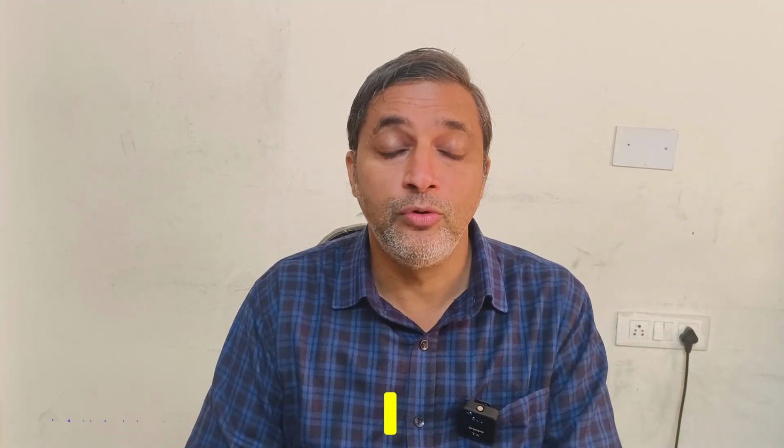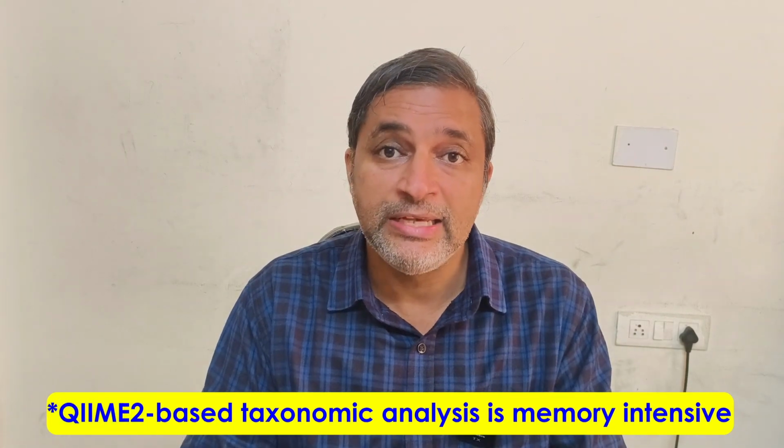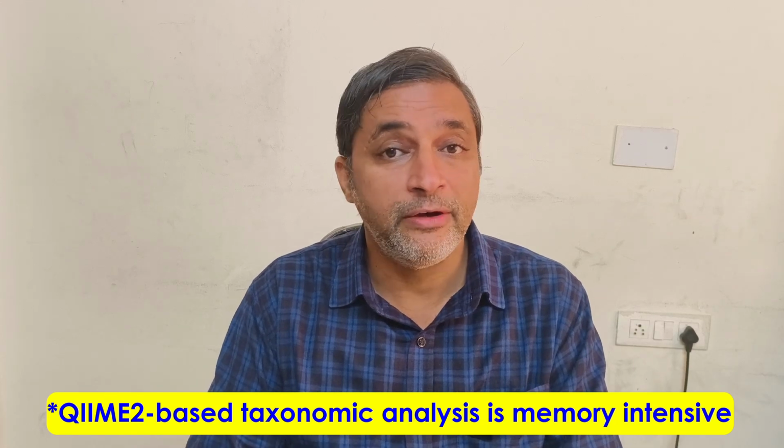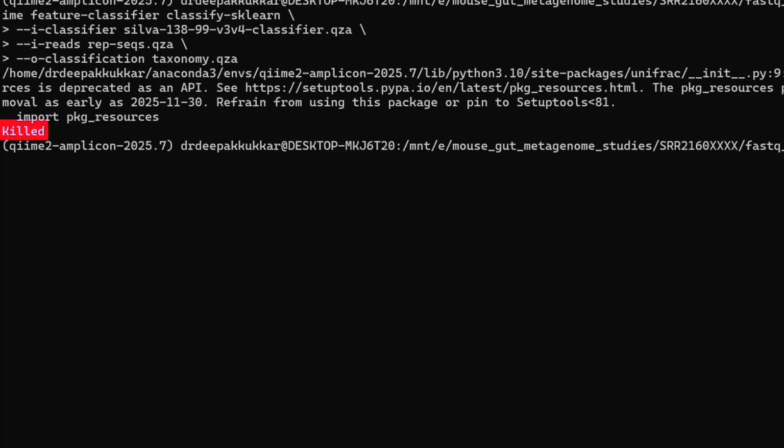And now, as you can see on your screen, we are going to run the step of taxonomic classification. An important point that you must know before running this step is that this particular exercise is memory intensive, and therefore you require a very powerful system for running this part. Otherwise, your system is going to repeatedly crash and you are going to get no result, which can be very frustrating for students.